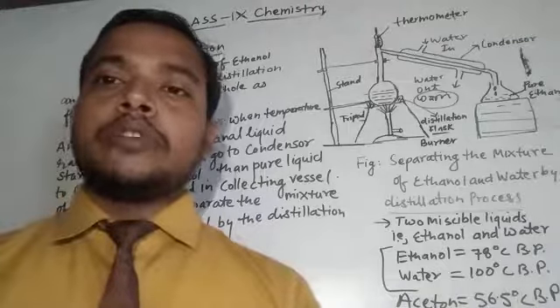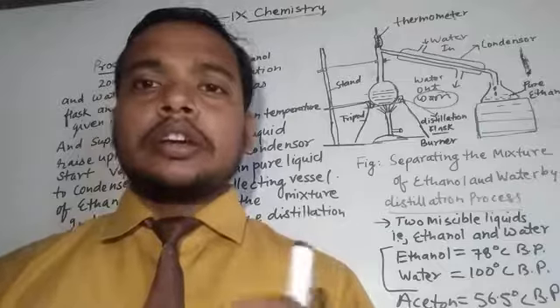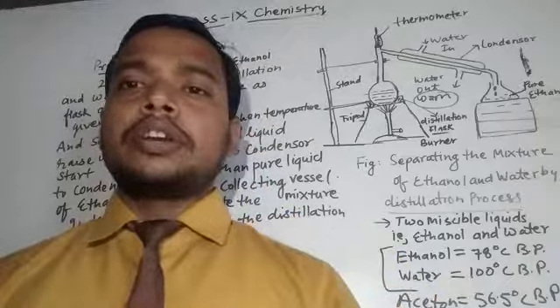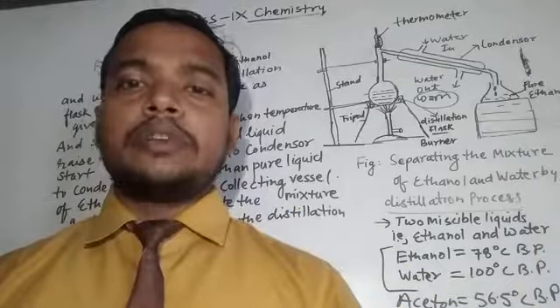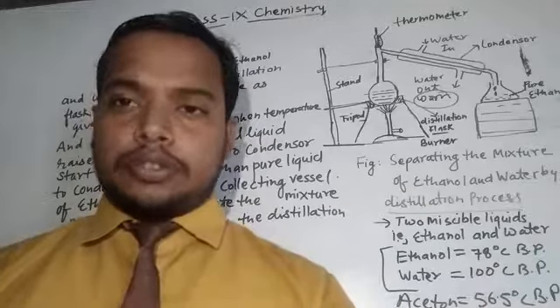So in this way we can clearly and easily separate different types of two miscible liquids with the help of the distillation process.